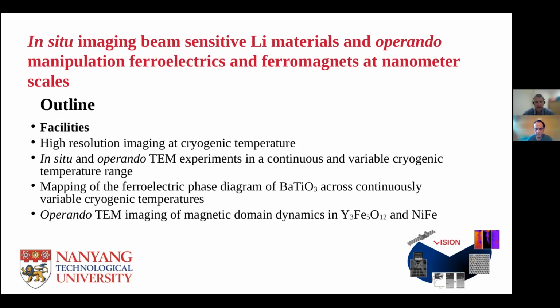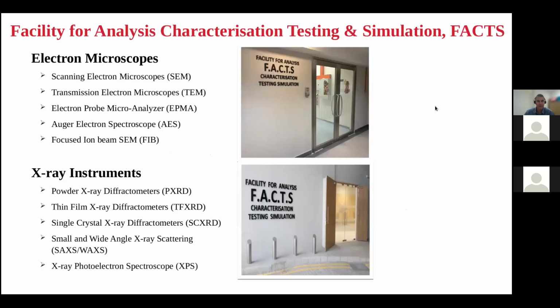And then I will present in situ and operando experiments at different temperatures, and also when devices are exposed to different electrical or current flow. I will focus on ferroelectric and ferromagnetic structures, as previously said.